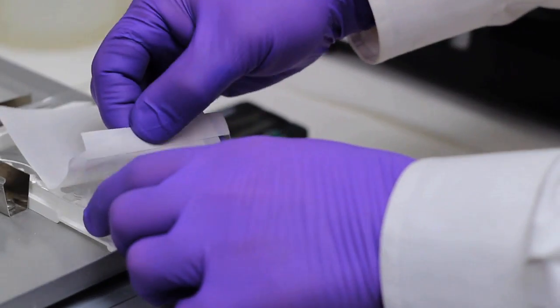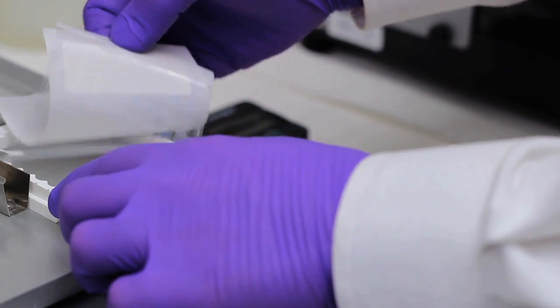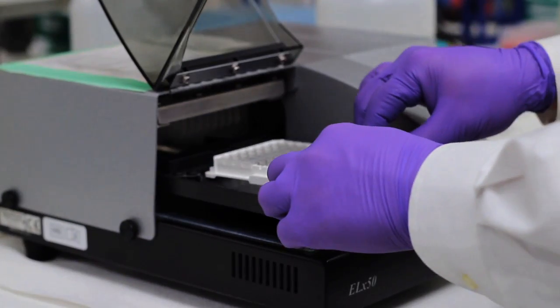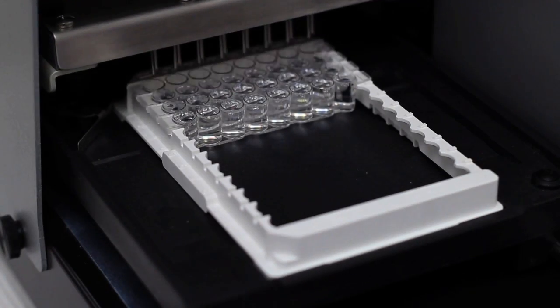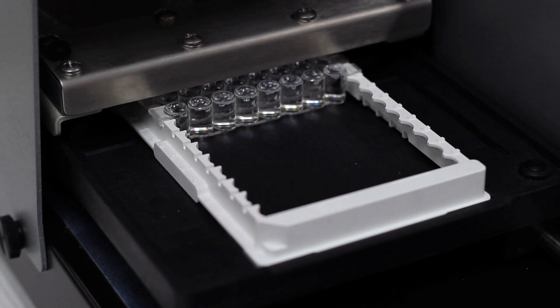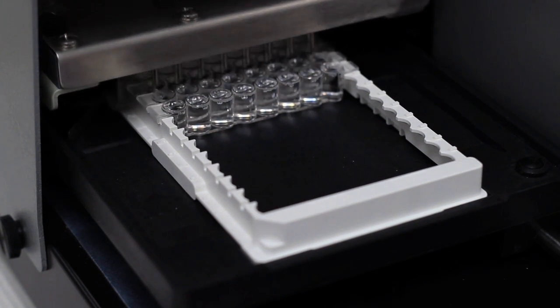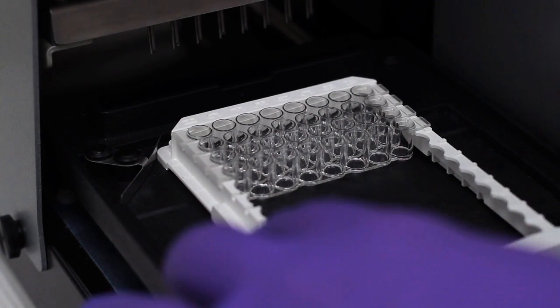After incubation, carefully remove the plate sealer and place the plate onto the rack of an automated plate washer. Program your equipment to wash and aspirate with 350 microliters of wash buffer per well. Repeat for a total cycle of three washes and aspirations. When complete, the plate should appear dry.